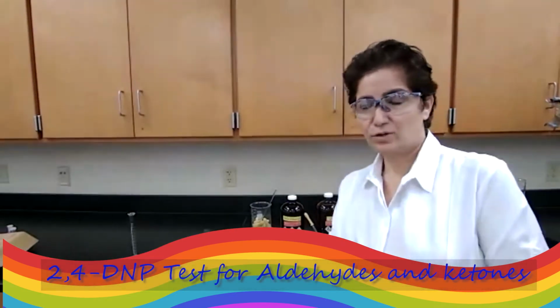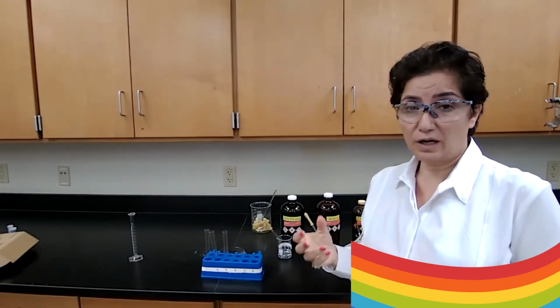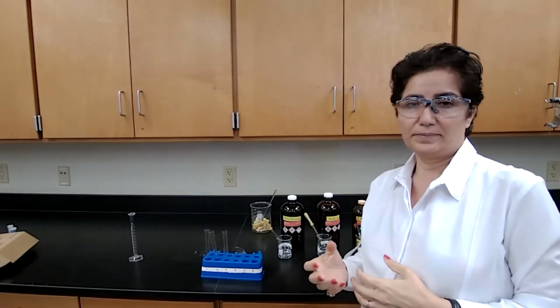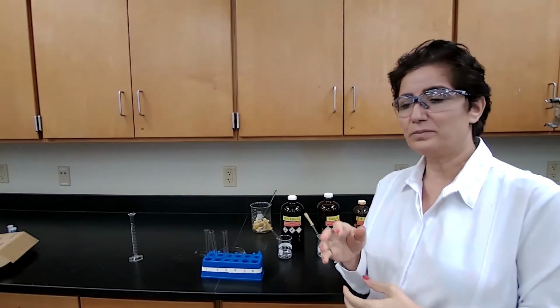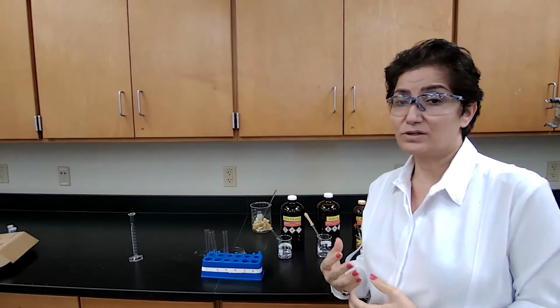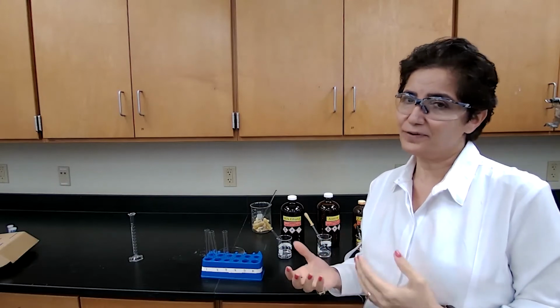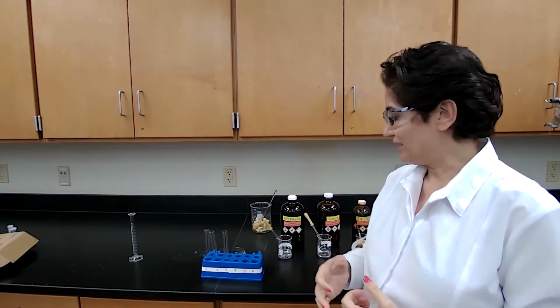Okay. Another group of organic molecules: the functional group that would be insoluble in water if it's more than 5 carbons, but if it is less than 5 carbons would be soluble in water, but it is neutral. So we have to find out what is the functional group. That's for aldehydes and ketones.